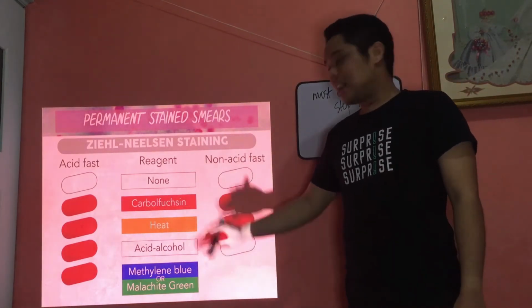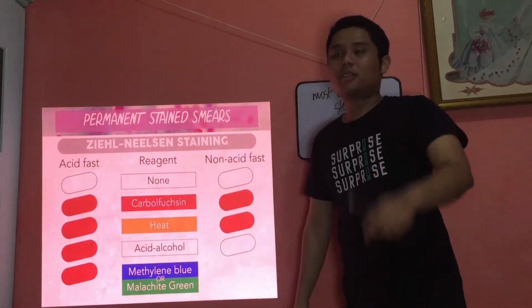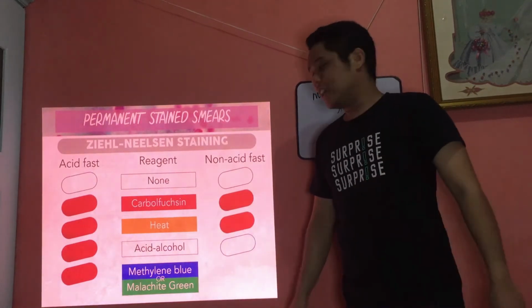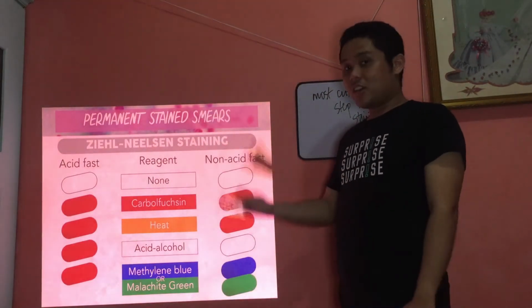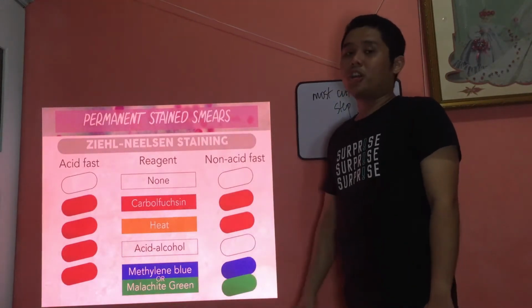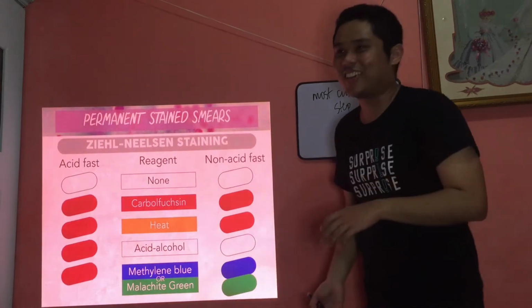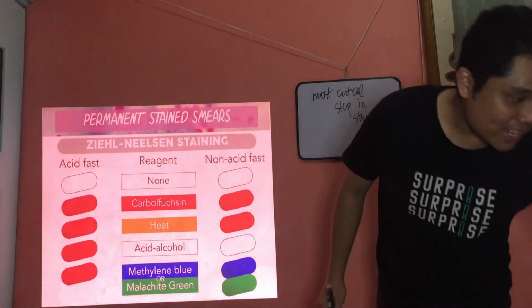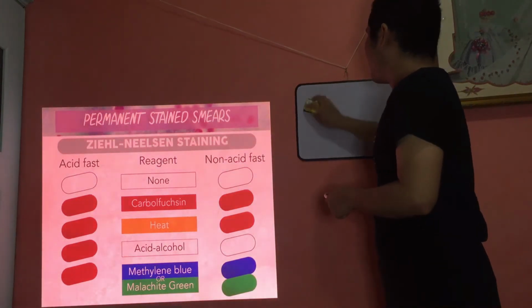So therefore, pag-add sa secondary stain, either methylene blue ba or malachite green ha, either lang, either. You don't use both, either lang. Okay, so kung methylene blue, of course, the organism will be color blue, and if it's green, malachite green, the non-acid fast organism will be color green. Okay, so is it sure or cause? Parang ganun charot. Okay, alright. Ayan, so that's for the acid-fast staining for Ziehl-Neelsen.